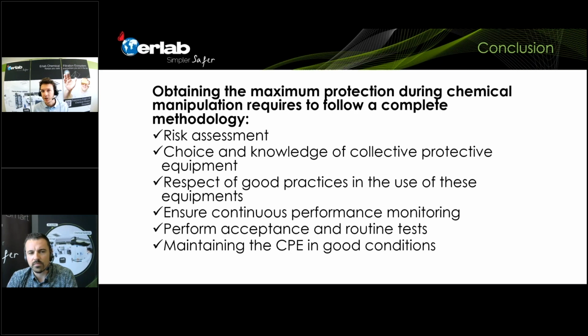So there is a double protection for the people who work with, for example, things that are viruses. You need to protect the people outside in the lab, but you also need to protect the samples inside so that there is no cross-contamination, for example. So that's a biosafety cabinet, and we don't provide that as EURLab.